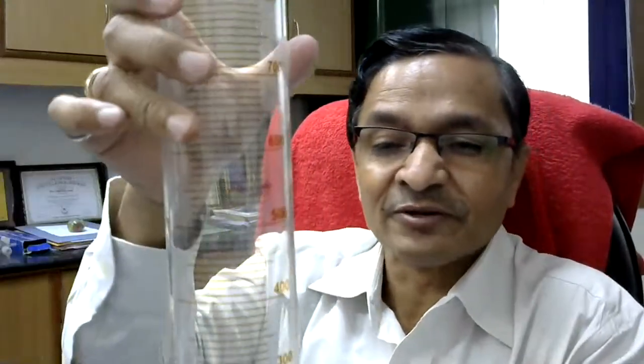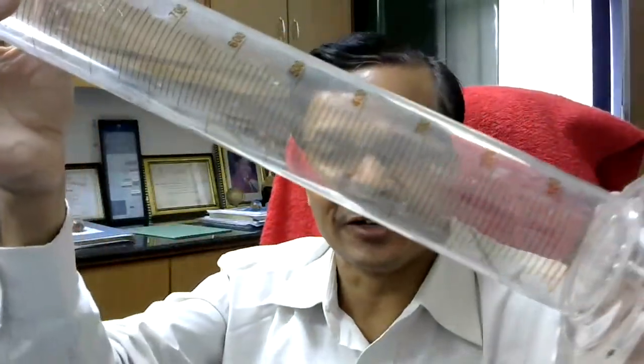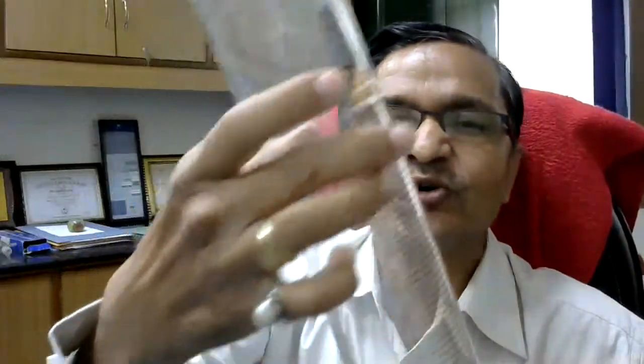Measuring. That marking is not for measuring the reagents. For making measurements, we have measuring cylinders, something like this. This measuring cylinder is 1 liter. Similarly, smaller size measuring cylinders are also there.